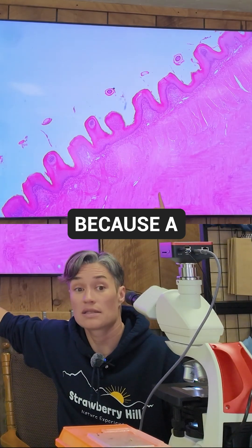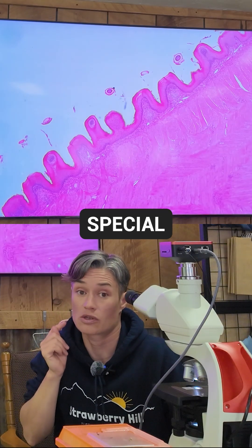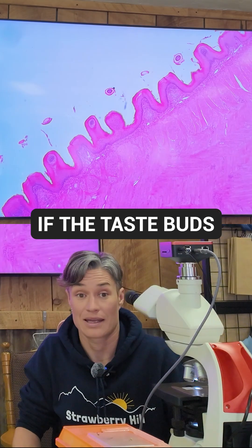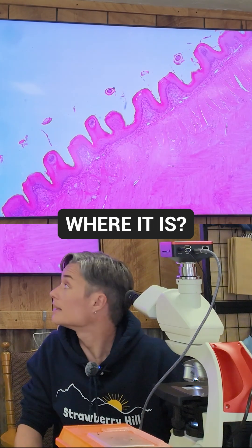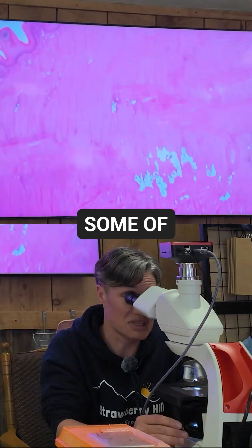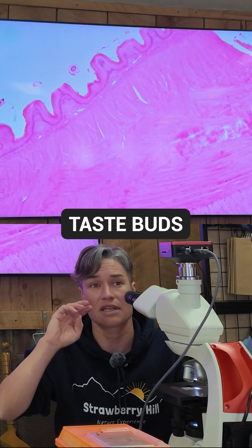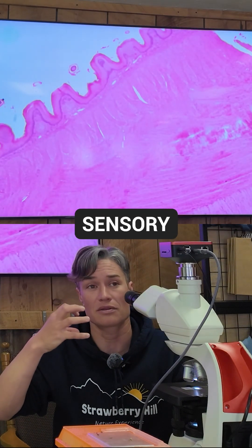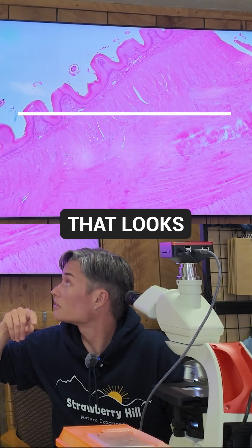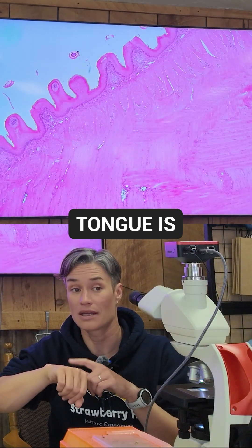This is pink because a special coloring was added. Even though our tongue is kind of pink, it wouldn't look like that on the slide without the special coloring. Taste buds — I don't know if I have taste buds here. Are those the taste buds? Some of them maybe. You have two things: taste buds for the sensory inputs, and the surface of the tongue that looks like this. Maybe they're integrated.